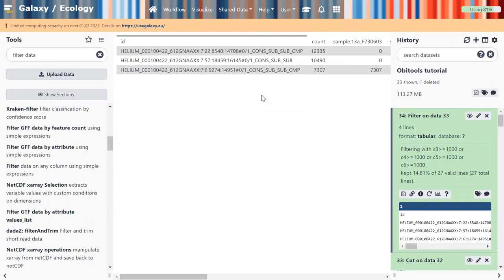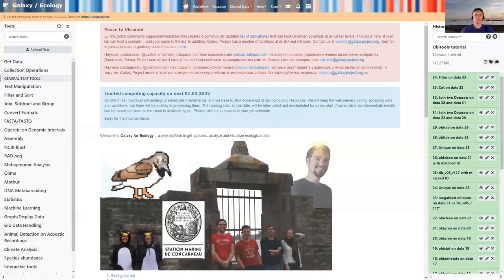So now you know how to pre-process metabarcoding data on Galaxy, producing quantitative information with quality checks and filtering results to interpret it and to have a synthesis table you can share broadly. Not that easy to get immediately, so I hope I didn't bore you too much with technicalities and that you enjoyed this training with me.